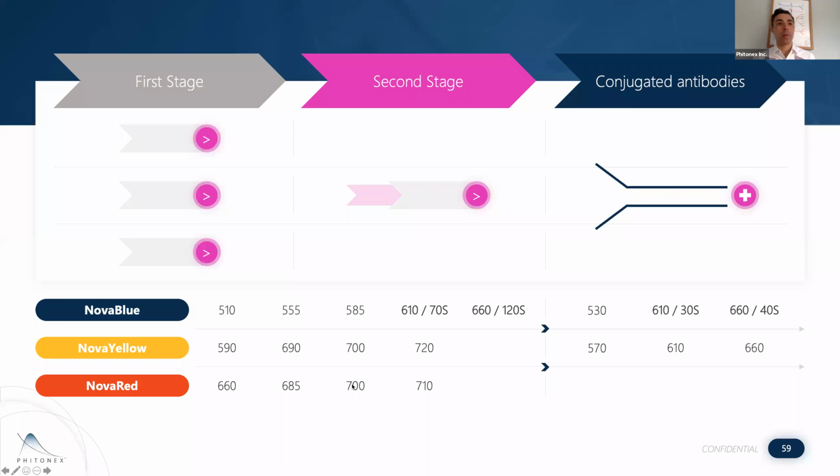And you can see too, I think the other point is, we're hitting gaps here of 10 and 20 nanometers, right? And that's on purpose, right? It's so that we can go in and really think around, okay, what kind of pressure can we apply to the hardware manufacturers so that, if you have clean fluorescence, you should have detectors every 10 to 15 nanometers and be able to use them all together, right?